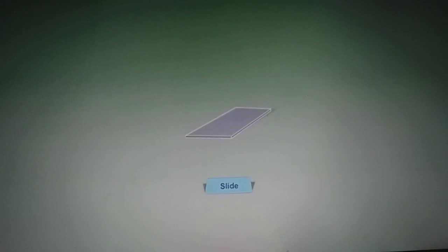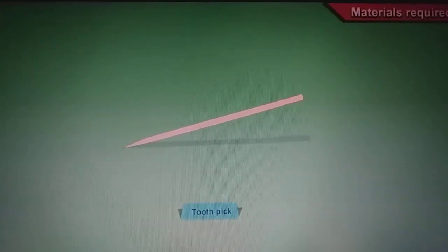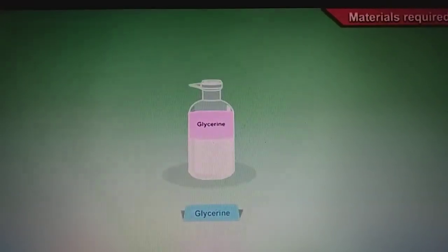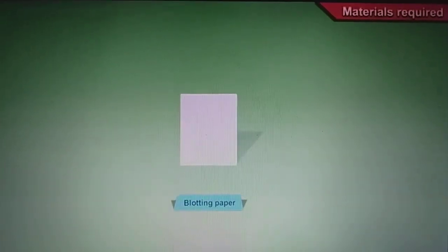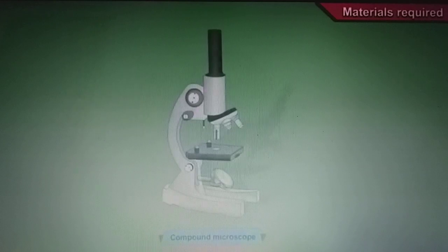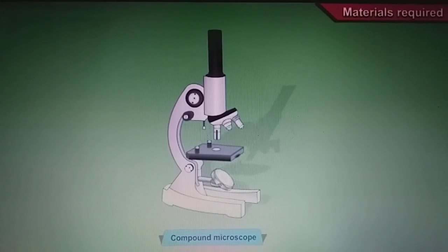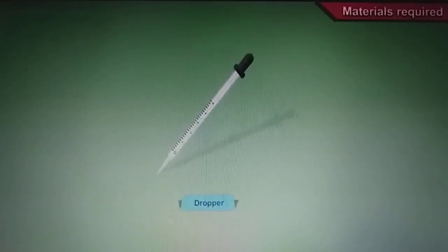Materials required: slide, cover slip, toothpick, glycerin, methylene blue solution, blotting paper, compound microscope, dropper and water.